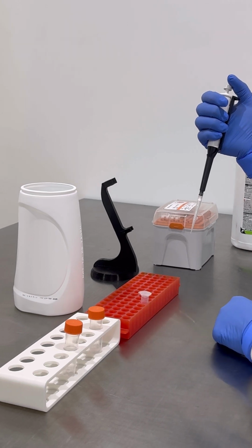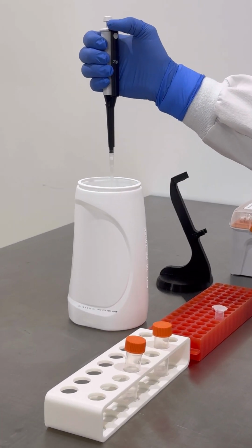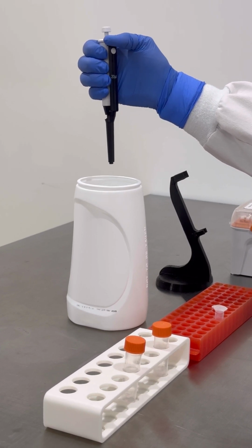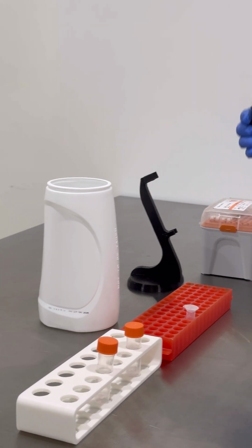Discard the tip into the disposal bottle by holding the tip just inside the neck of the disposal bottle and pressing the black tip ejector. The tip should drop off into the bottle. Place the micropipette back on the stand.